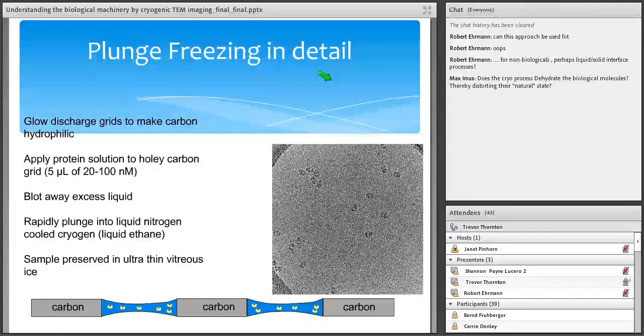Yeah, I can see why this is key to the whole process, because if I just freeze water in my ice tray at home, it cracks and everything changes shape. Exactly. It's a big advantage of what Jacques Dubochet did with this method. He worked out a lot of different methods, how to cryosection as well as doing the plunge freeze process. Until he came along, no one really ever tried this, and the technological difficulty of putting something frozen into an electron microscope was horrifying to most people.